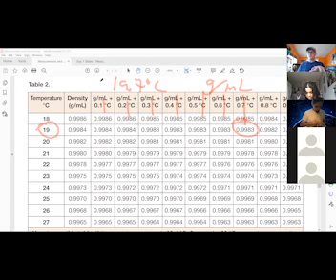And like I mentioned before, you write your procedure, you write your results, and then you write what your conclusions are. Part of your conclusions are what were your sources of error. And so this would be eliminating one of those sources of error. Because if everyone just used 1.0 grams per mil, that'd be fine. We'd all get pretty close to the right answer, but it wouldn't be as precise. So this helps eliminate some of that error.